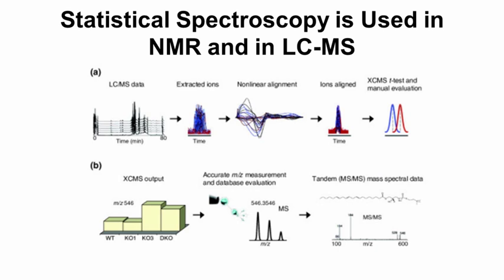In the world of LCMS, we're often dealing with a much more complex mixture, many more thousands of peaks than we might deal with in NMR. But in LCMS, the standard protocols are typically to take lots of spectra, to align them, and then to extract those aligned peaks and identify the ones that are most significantly changed from sample to sample or cohort to cohort.